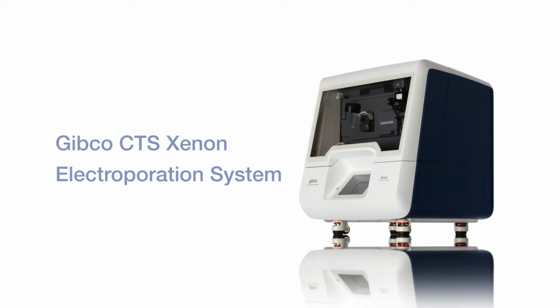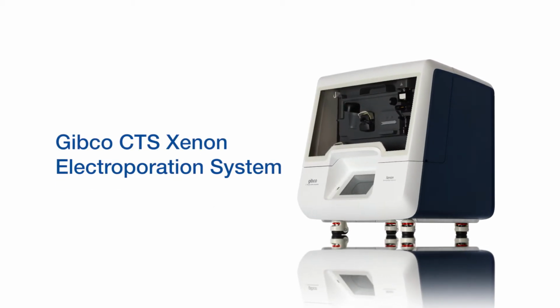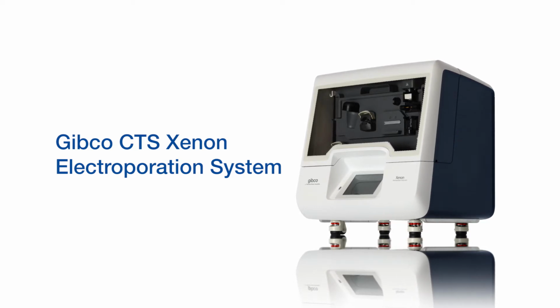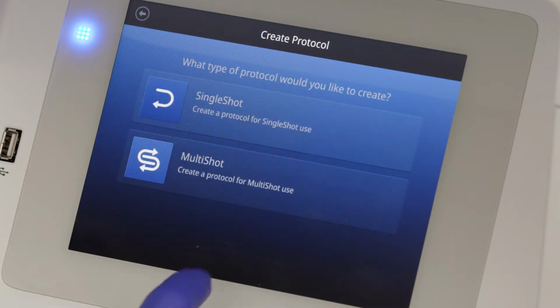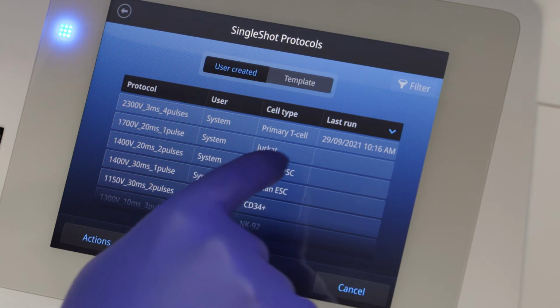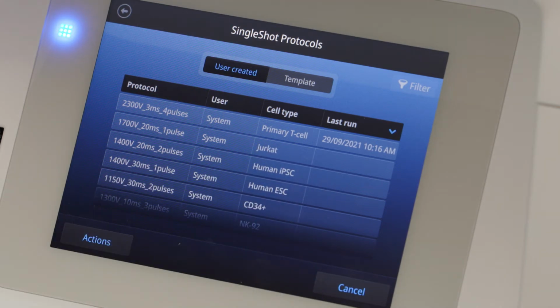The Gibco CTS Xenon Electroporation system features an intuitive touchscreen interface that makes it easy to create new protocols. First, tap Create Protocol and select a type of protocol you'd like to create, either single shot or multi-shot. Next, tap Create New to make a new protocol, or tap Open Existing to modify a protocol you've already created or one of the cell-specific protocols pre-programmed into the instrument.